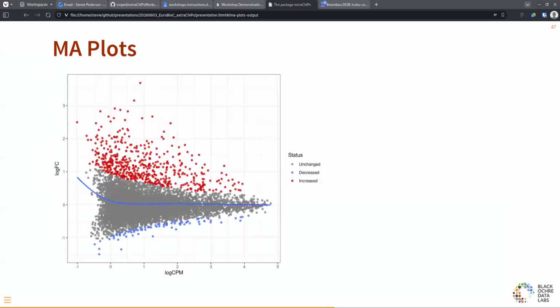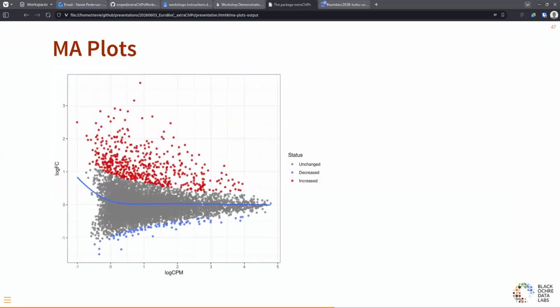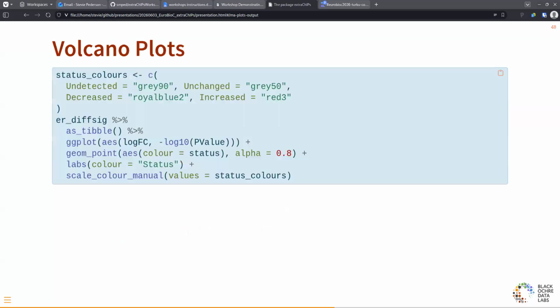So you can just grab MA plots. Oh, there it is. Looks good to me. What have I done? I've done loess. Yeah, I'm fine with loess. I often get those little kicks at the low end. They never bother me. It just means there's a few low signal points that are upregulated. It's the overall bias that I'm interested in.